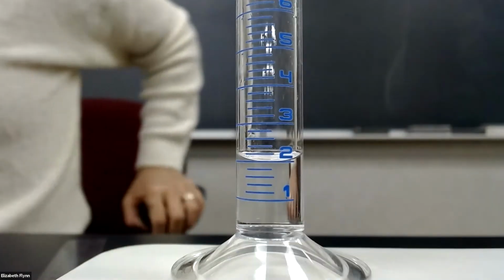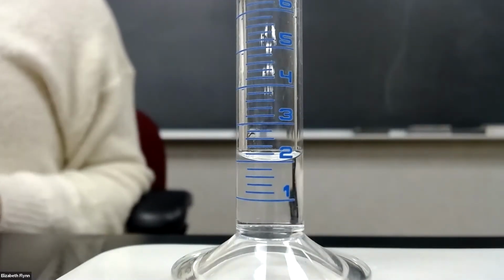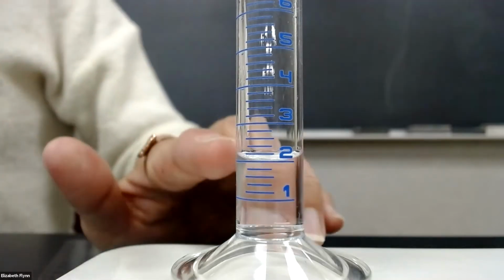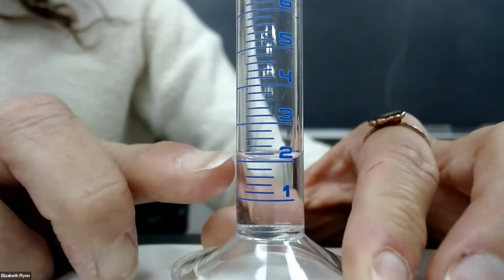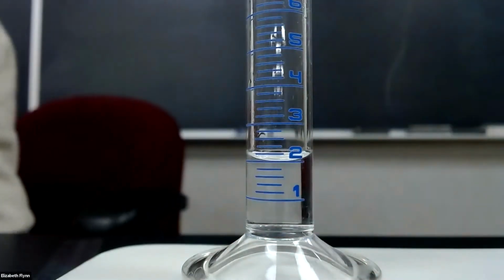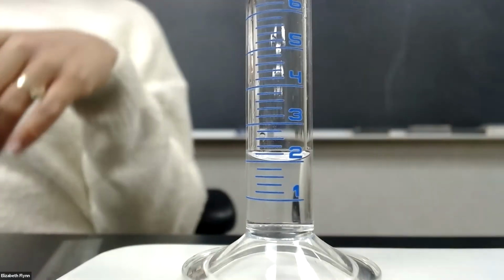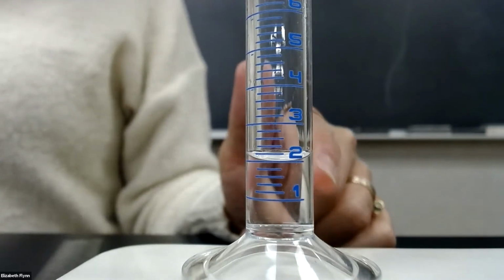Okay, so here we are, my 10 milliliter graduated cylinder. And what do we report this volume as? Right, exactly. 2.0, right? Now, the bottom of the meniscus is exactly on the line, right? So we report that as 2.0 milliliters. So these 10 milliliter graduated cylinders that you have in your lab kit can be measured to the 10th of a milliliter.